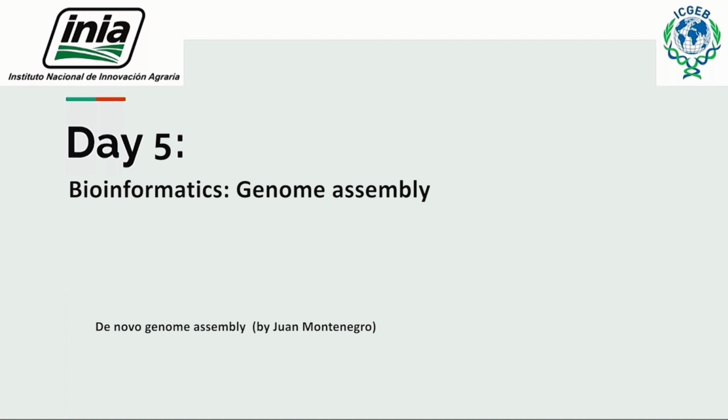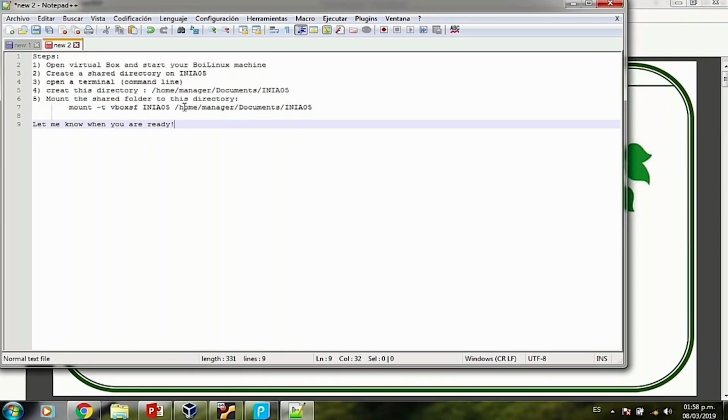Right, guys? Please follow the instructions that are right now on the screen. If you don't remember how to do any of those parts, please don't hesitate to ask either David, Juan, myself, or Reinhard. First thing, open your VirtualBox and start your BioLinux 8 machine.